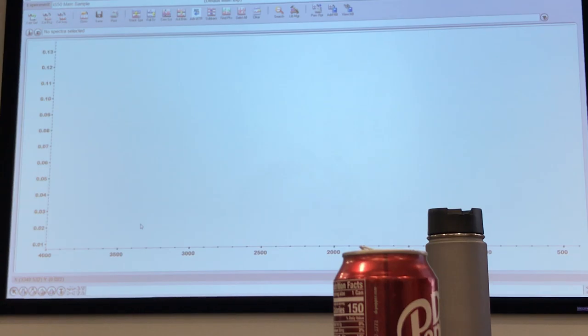Go further into it. Totally. I just want to see. So, just specific to the IM10 MX device, when you're imaging, when you're doing the rapid imaging, it has to be reflectance.